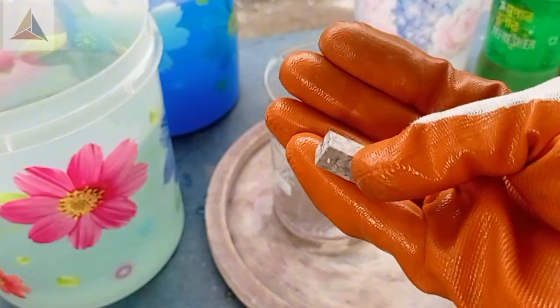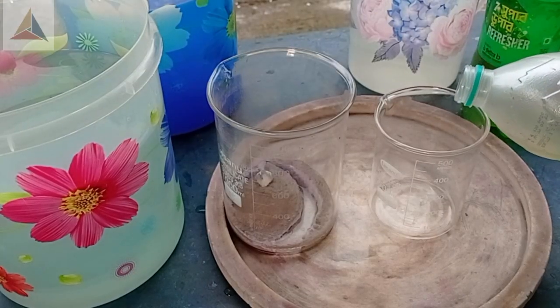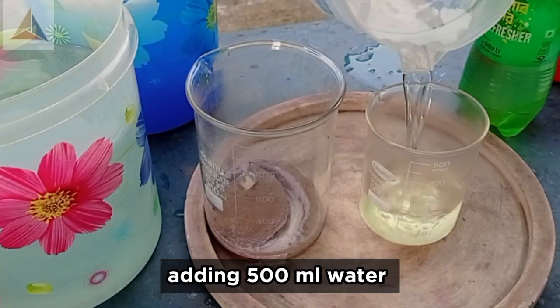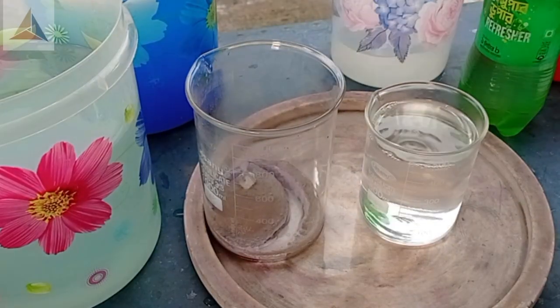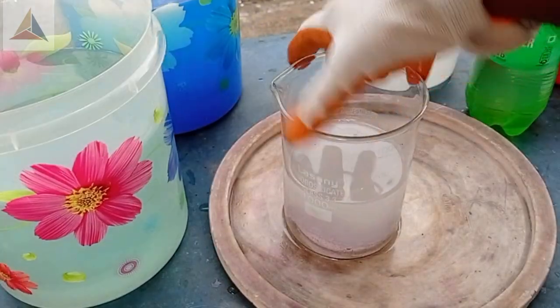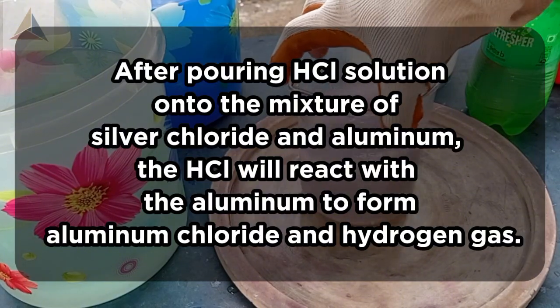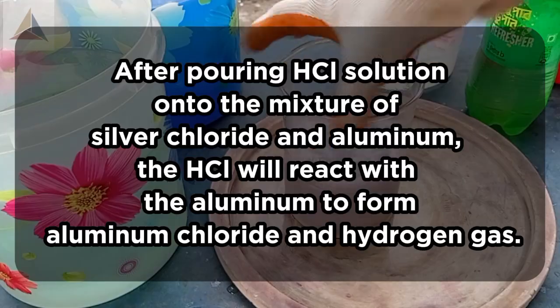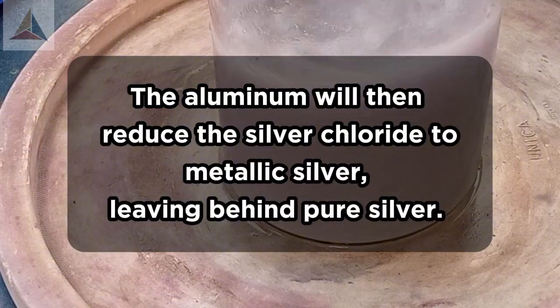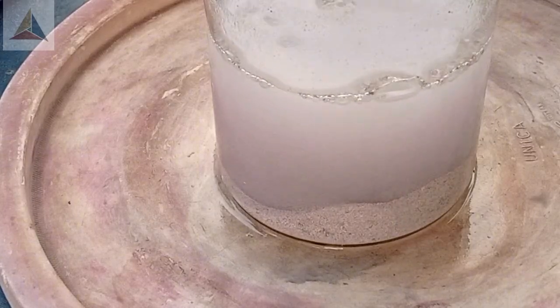Now I'm going to add 10-12g of aluminum with the silver chloride. Taking 100 ml HCl and adding 500 ml water, then pouring the HCl solution. After pouring HCl solution onto the mixture of silver chloride and aluminum, the HCl will react with the aluminum to form aluminum chloride and hydrogen gas. The aluminum will then reduce the silver chloride to metallic silver, leaving behind your silver. Leave it overnight.